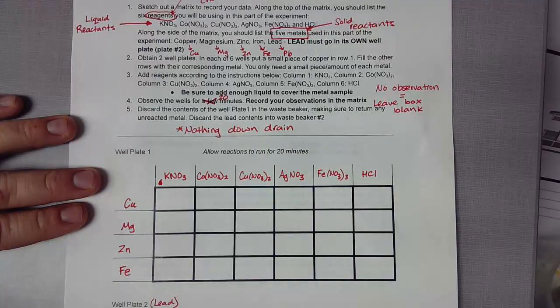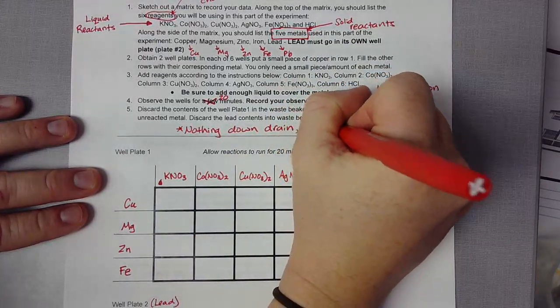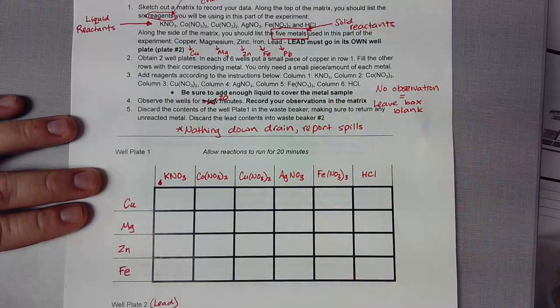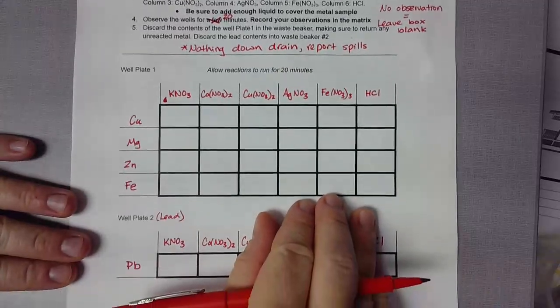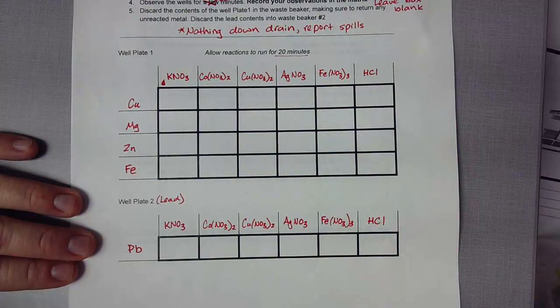Safety concerns are the same that they've been all year. Report all liquid spills to me, your teacher. All right, so let it run for 20 minutes.